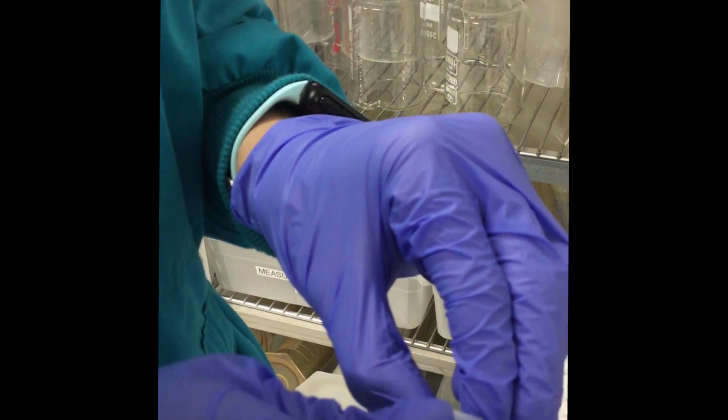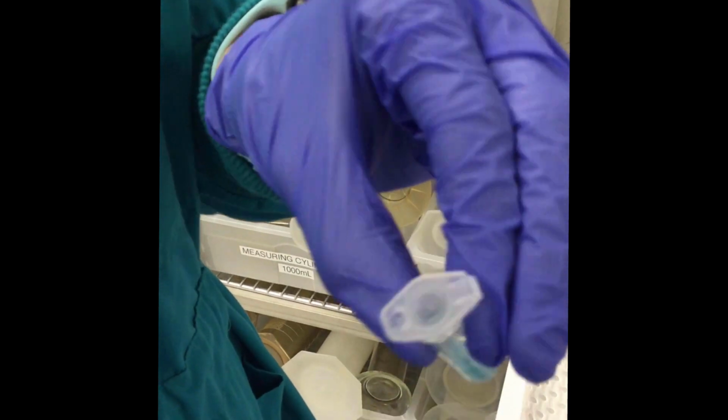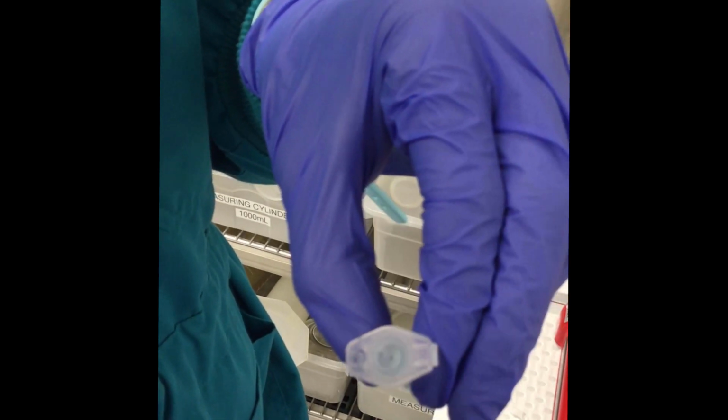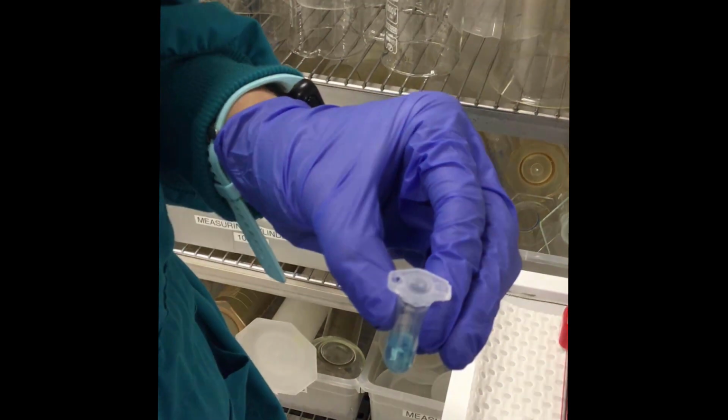In this next little video, Claire's going to show you how to puncture the tubes. But just remember, it's the demonstrators that are going to look after the lancets, so you will have to go to them to get one. So typically we'll pierce twice, being very careful with the lancet, before we put the solutions in the heating block.